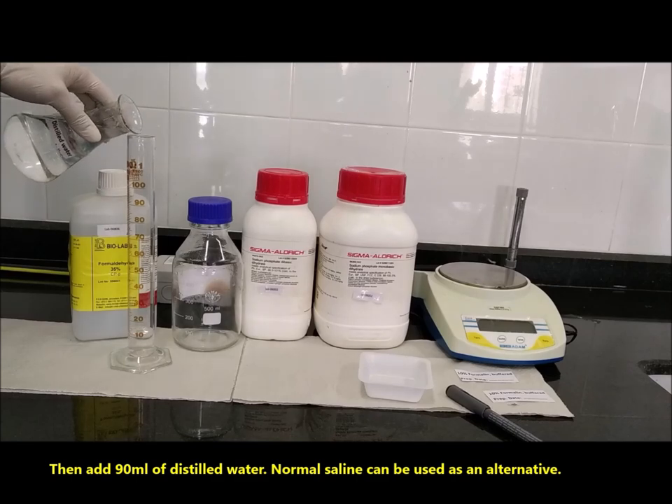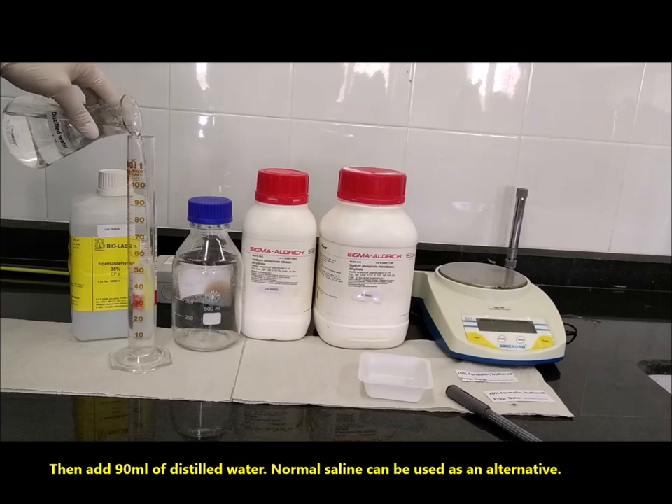Then, add 90 ml of distilled water. Normal saline can be used as an alternative.